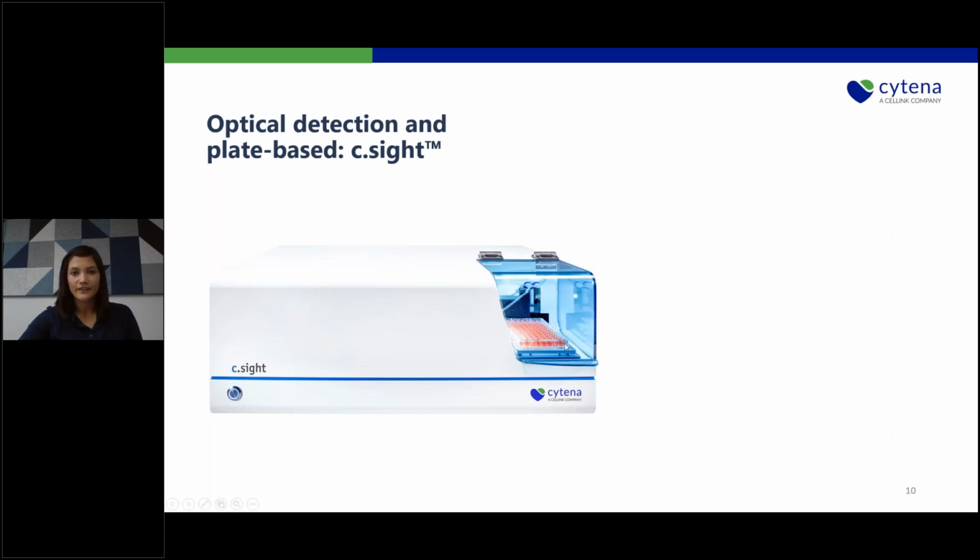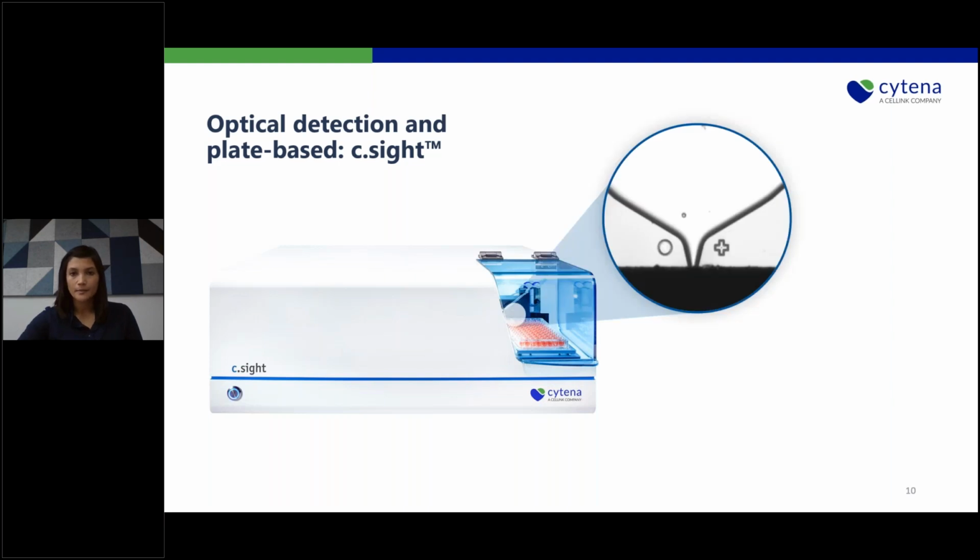This device uses cartridges, and the cartridges contain small microchips. If we zoom into such a microchip, it looks like that. This here is the nozzle of the microchip. And here you see that the cell is moving towards this nozzle. And here at the nozzle end, actually, the droplet is generated.